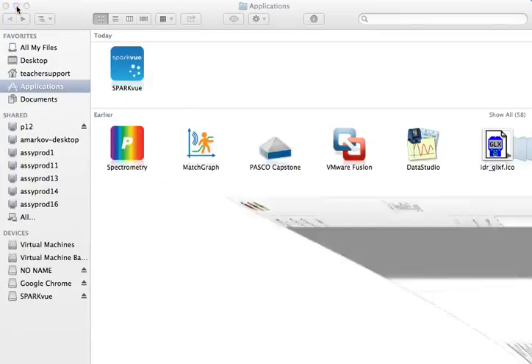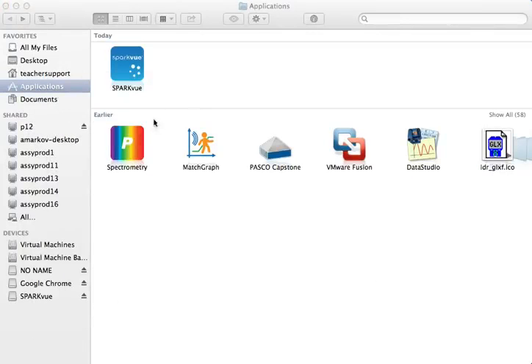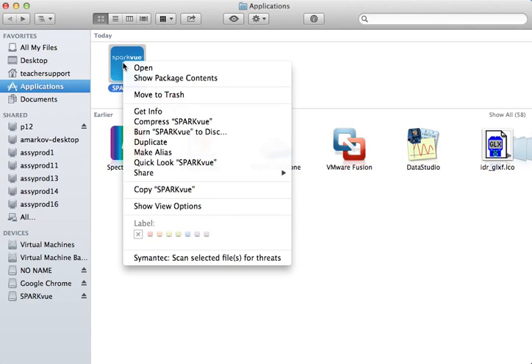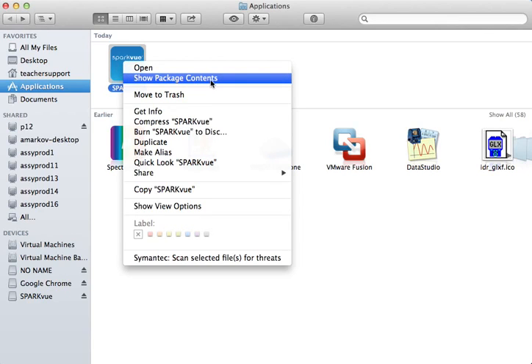First, I'm going to navigate to the Applications folder with the SparkView icon. Next, I'm going to control-click on the SparkView application icon and go down to Show Package Contents.